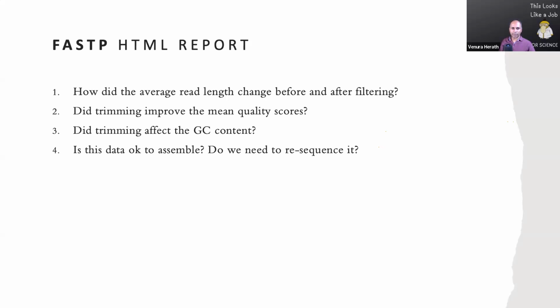So go ahead and answer the questions by looking at your data. There are 4 questions.